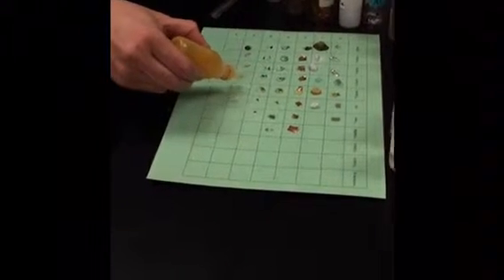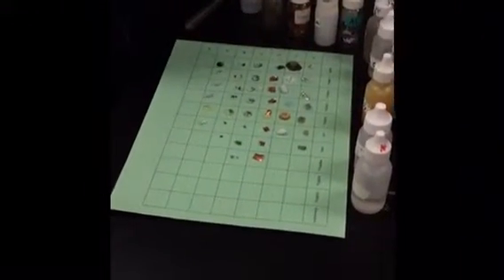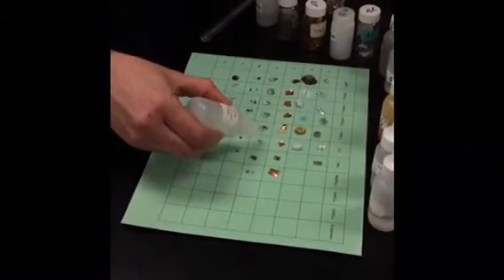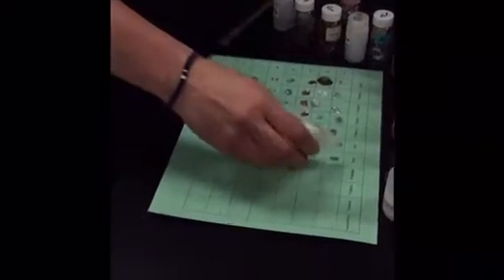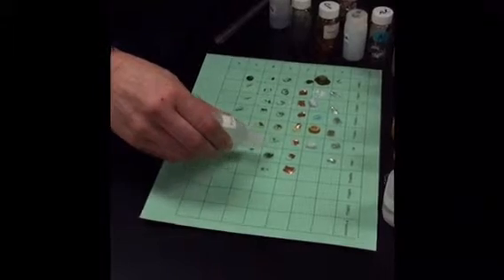You will share your data with the class by putting a mark on the board for each combination where you saw a reaction. In the last column, you will put the total number of reactions that that metal showed. And that's how you will compare the relative reactivities of each of your metals.